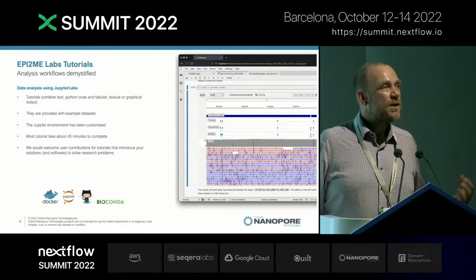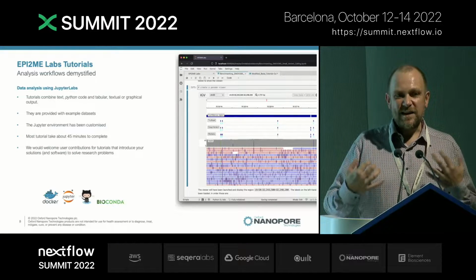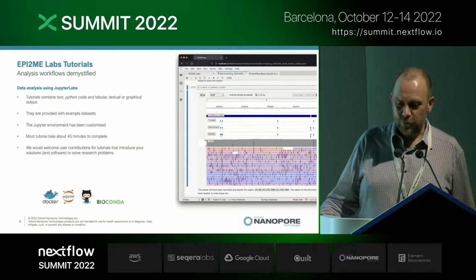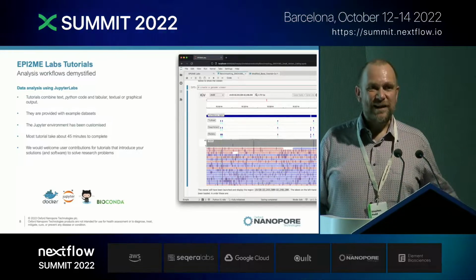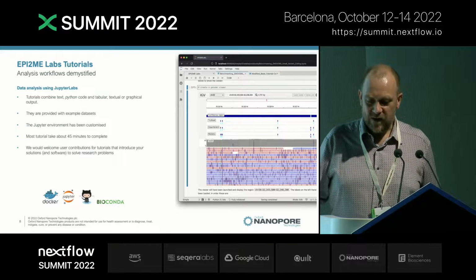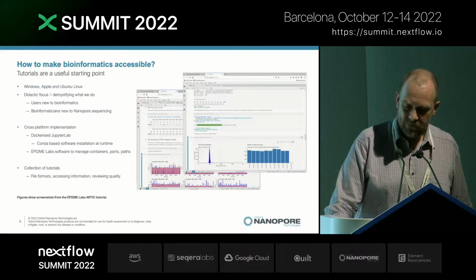They could understand the nuances of working with Oxford Nanopore sequence data, and we were trying to appeal both to bioinformaticians who wanted to learn how we would solve particular problems using Nanopore sequence, and to non-bioinformaticians, saying, hey, it's not actually that scary. There are some pretty preordained commands that you can use to analyze sequence data. So anyhow, it worked. The world was in order.